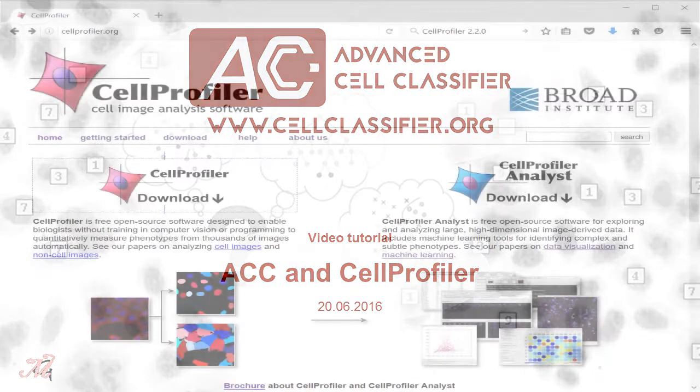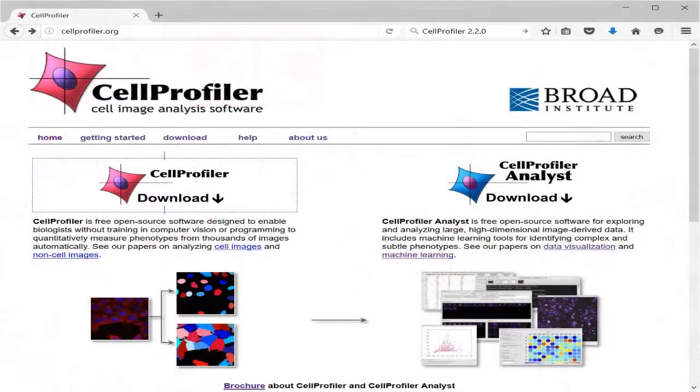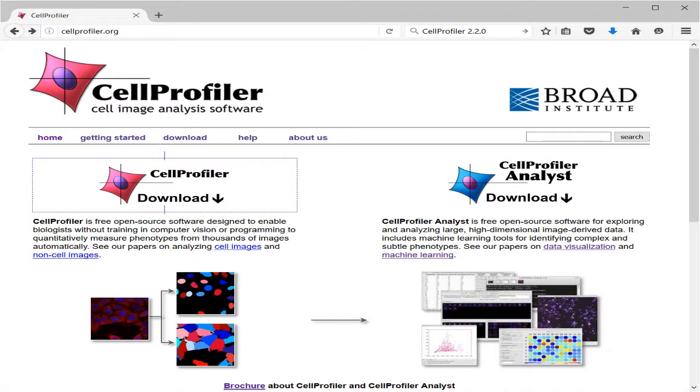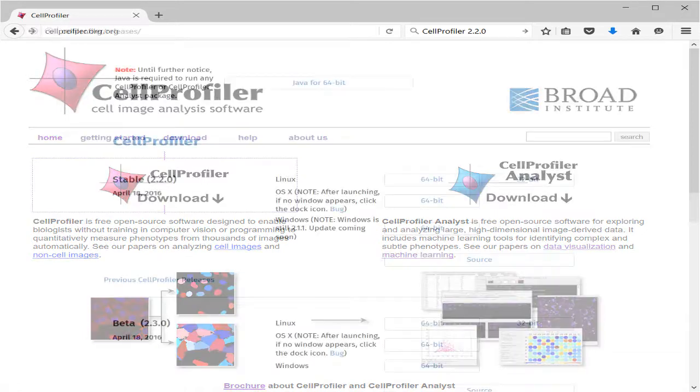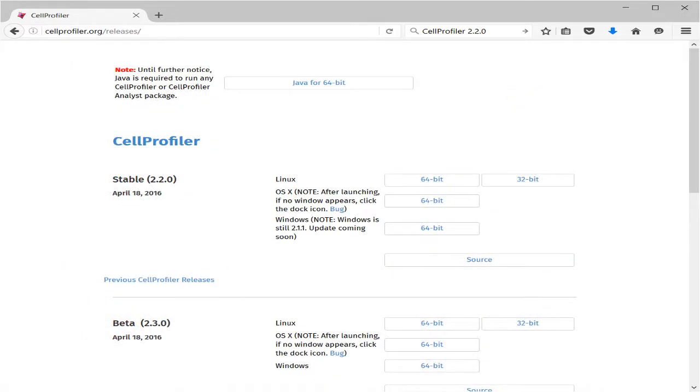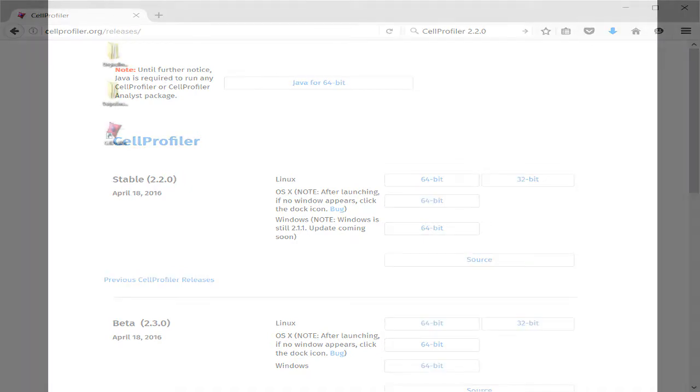Here, we will use the Cell Profiler 2.2.0 Python version. Please read the help documentation file provided with Advanced Cell Classifier for information about how to use other Cell Profiler versions. Download Cell Profiler at cellprofiler.org.